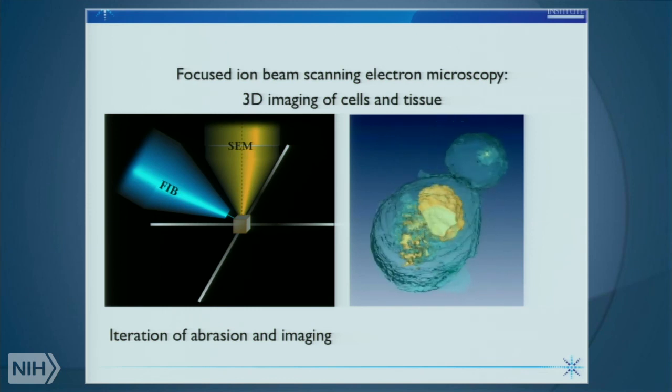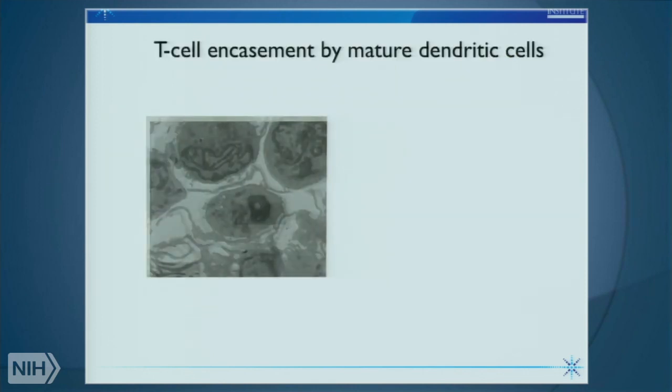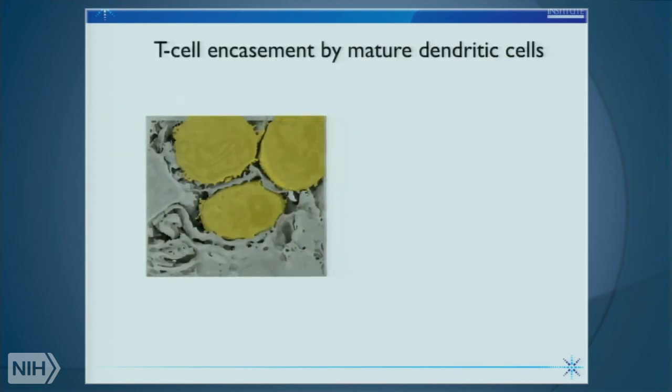But a decade or so ago, this was not very exciting, because at that time, you could already get to resolutions like this with confocal microscopy. The resolutions we had at that time were perhaps 200 nanometers, 150 nanometers. But over the years, we are now at resolutions between 5 to 10 nanometers in 3D, in the Z direction. So that, of course, is a very different level of information. But the development of this technology paid rich dividends for the HIV work we were doing.